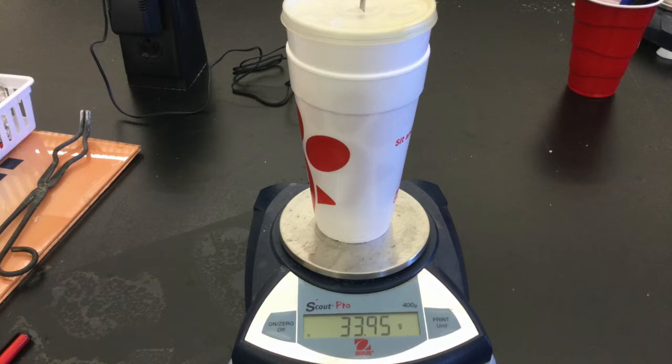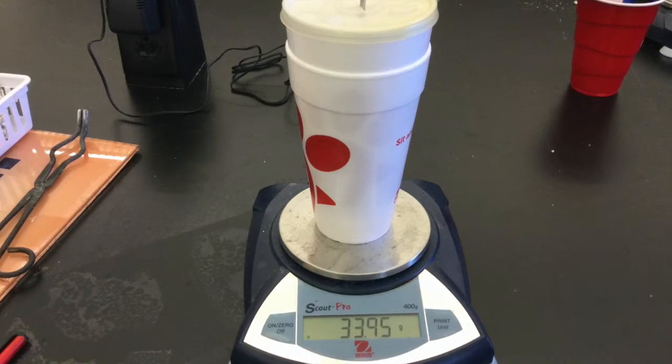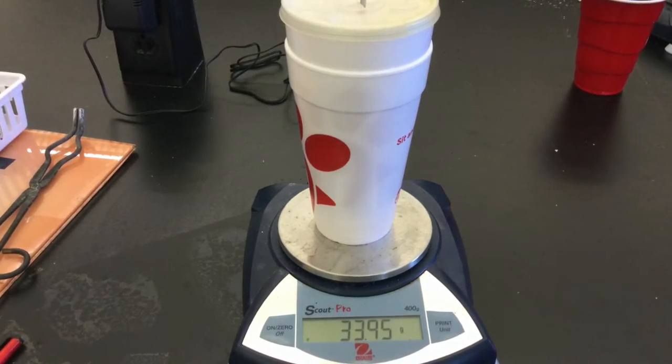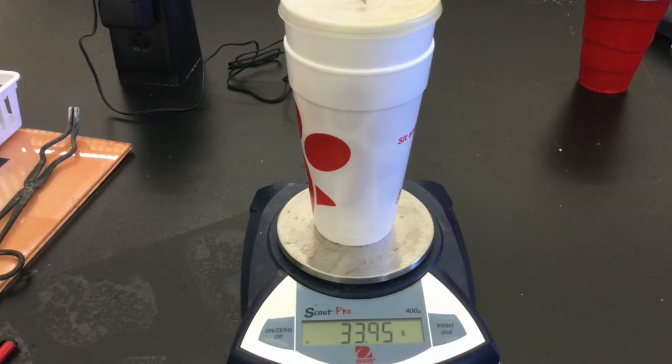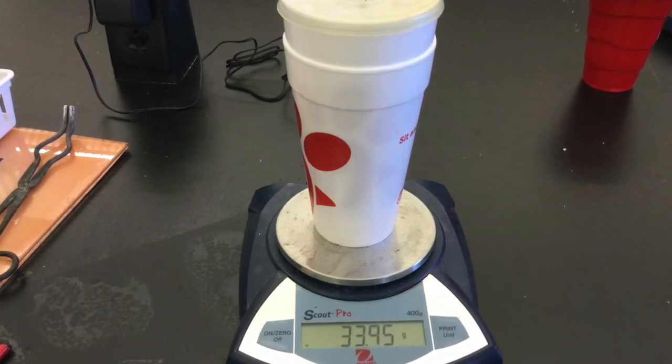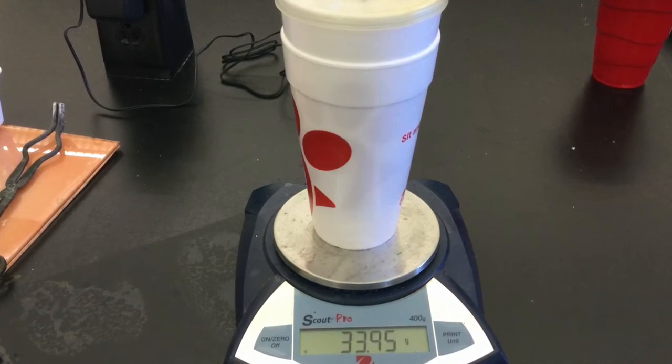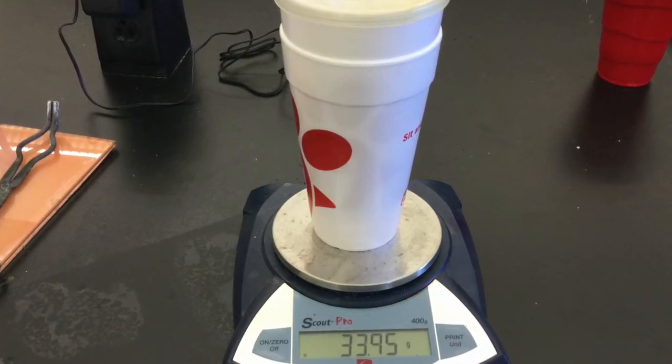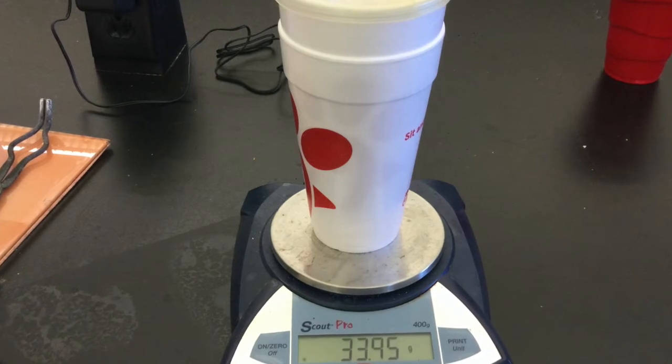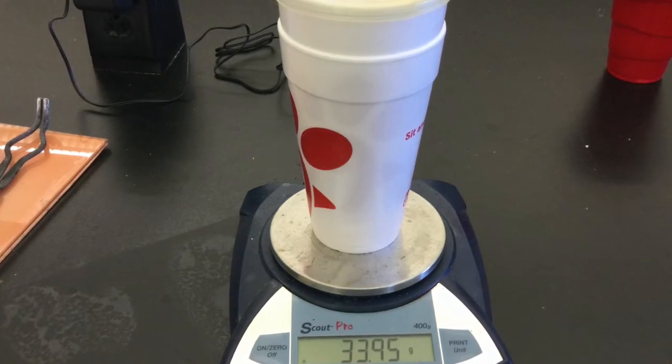Throughout the experiment, you will be using the difference in mass between the calorimeter when full and the calorimeter empty to determine the mass of the solutions, so you need to make sure you have the mass of the calorimeter at the beginning. Be sure to include the mass of the thermometer in the mass of the calorimeter so that you can include this each time you do the measurement later.